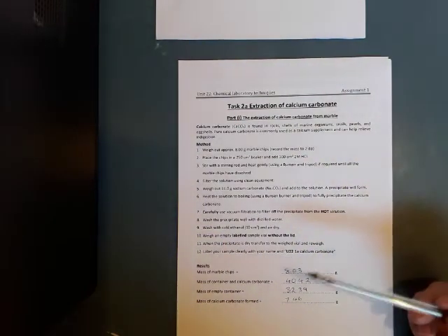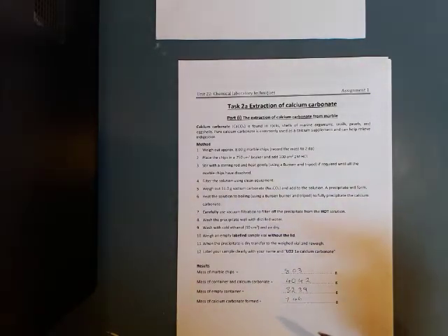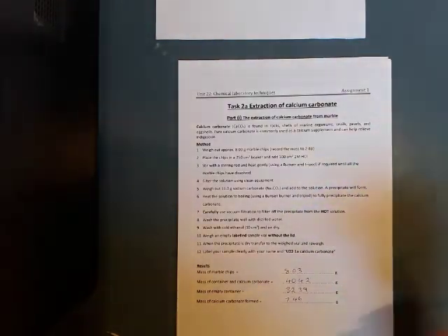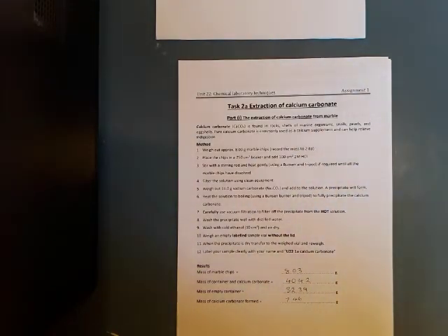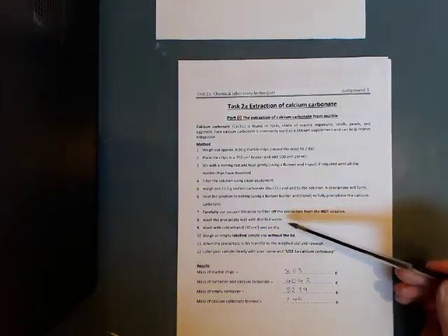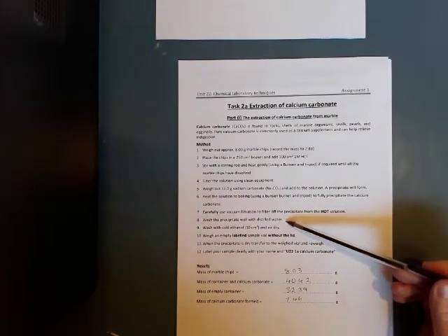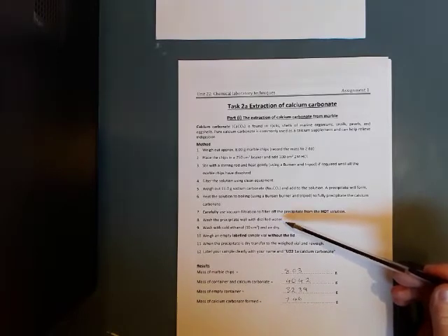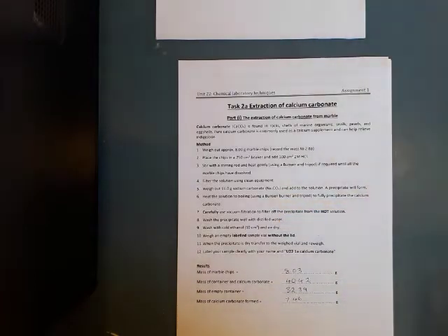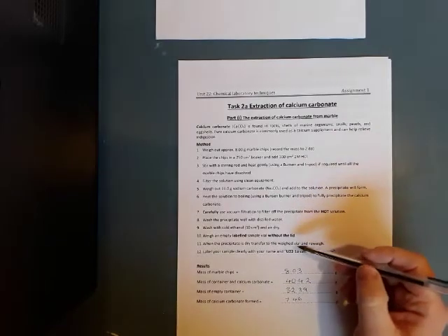Next one is, if we look at number 8, washing the precipitate. So we've done hot filtration using the Buchner filtration system. And again, I mentioned calcium carbonate isn't really soluble, but it is partially soluble in water. So if we wash the precipitate with distilled water, we're cleaning it, trying to remove any other impurities. But in the process, we could potentially wash away some of the calcium carbonate. Then we give it a wash with ethanol. It's not soluble in ethanol. And we're allowing it then to air dry. The ethanol will help get rid of residual moisture within the precipitate as well.